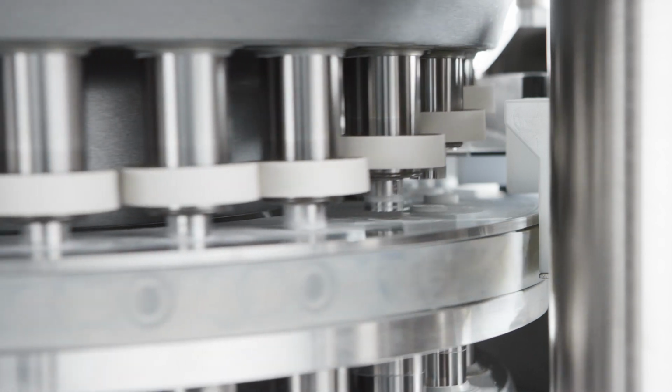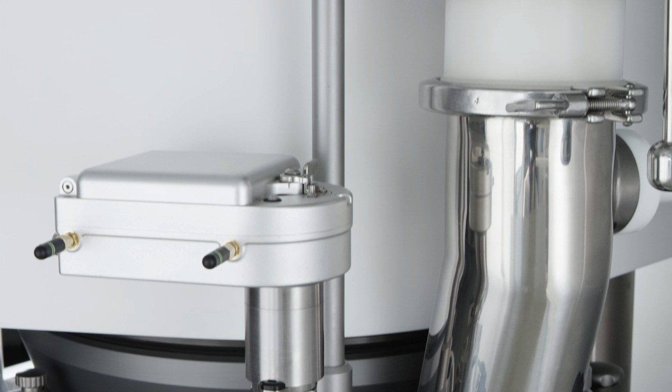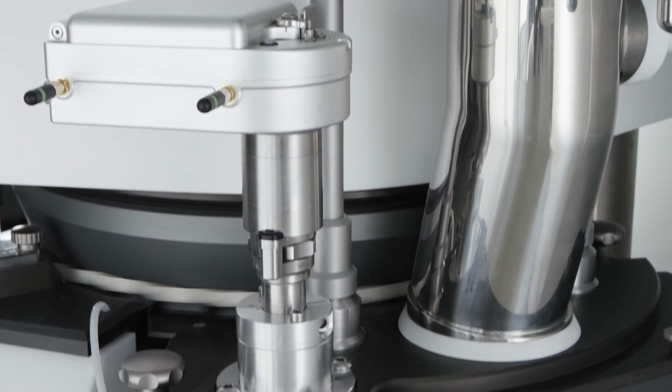As you can imagine, control means knowledge, and knowledge can literally convert information into action. Quality by design and PAT approaches are linked to this concept, basically because they are a proactive mode to put the hands on the process by managing the variability in a well-known design space where tableting adjustments are performed in real time. But before the action, it is very important to properly collect information, and inserting the probe in specific and critical points of the tablet press is the key to ensure results.